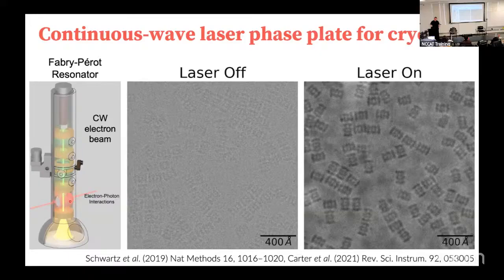And I know that in Holger's work, they have not had problems with overheating of the sample. It's not close enough that it will have a heating effect that will melt the sample. But it's a good question, and a good concern, actually. A lot of people have that concern.